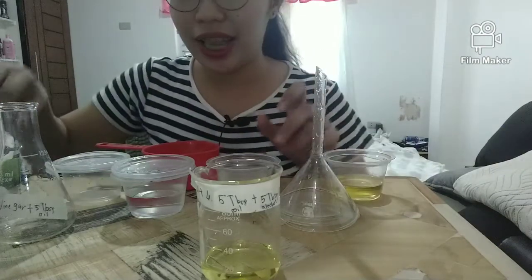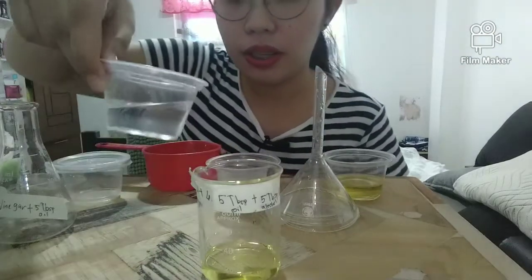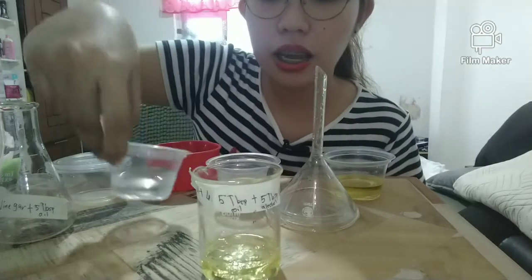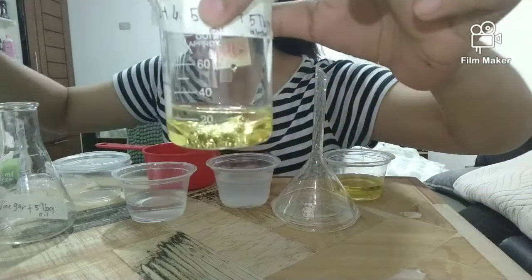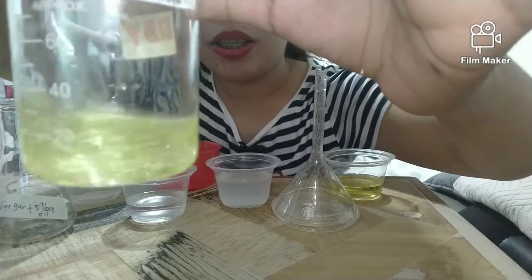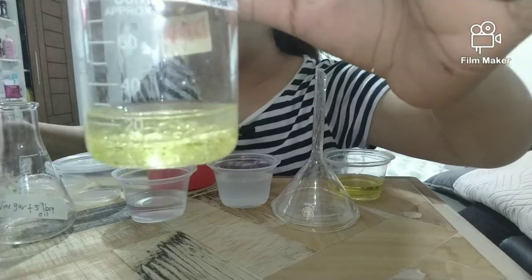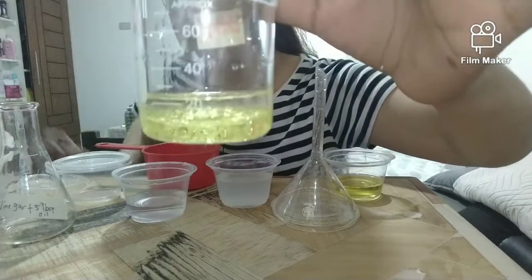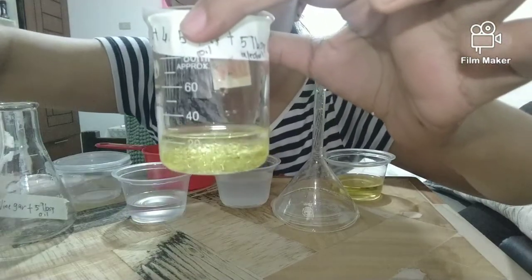Then we're going to mix it with some alcohol. Just see the reaction of these 2 compounds. I'm going to mix it. What do you observe on this mixture? Are the alcohol and the oil mixed up or not? Please write it down.